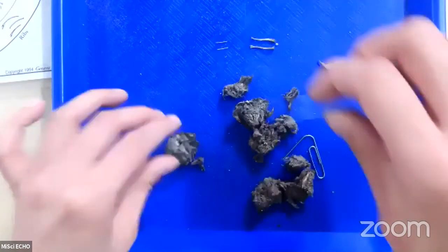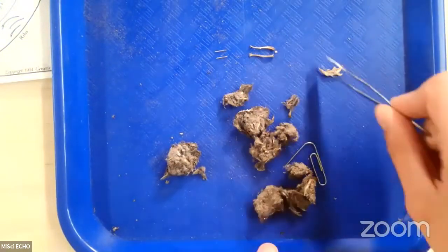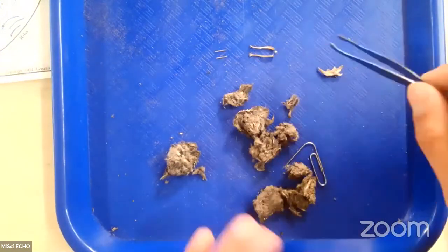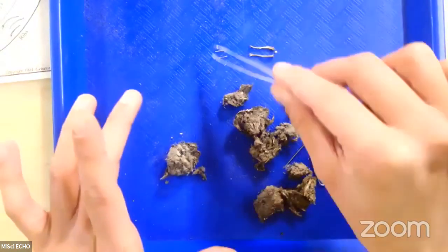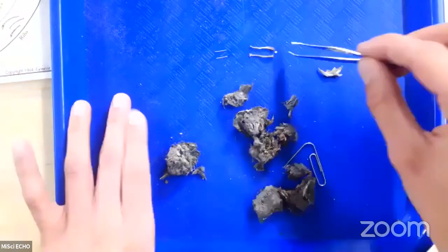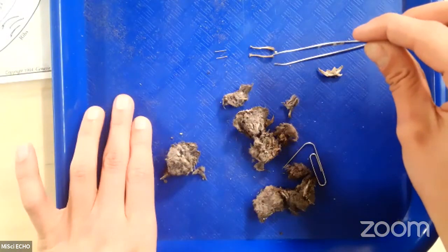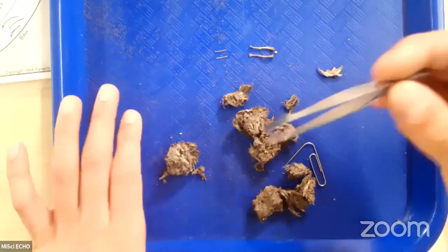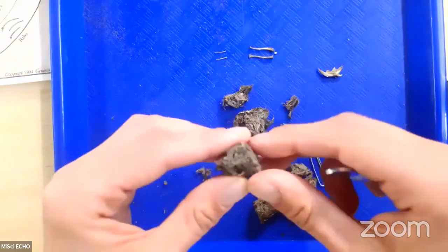Now you can see that even when I just broke apart, I'm starting to pull out some smaller pieces. And before we get into identifying those, what I'm doing is just sorting them by what they look like. So these two look very similar to each other. These two look like they're the same type of bone from the same type of animal. I've got our jaw piece set over to the side, and I'm just going to continue doing that as we pick through our owl pellet here.